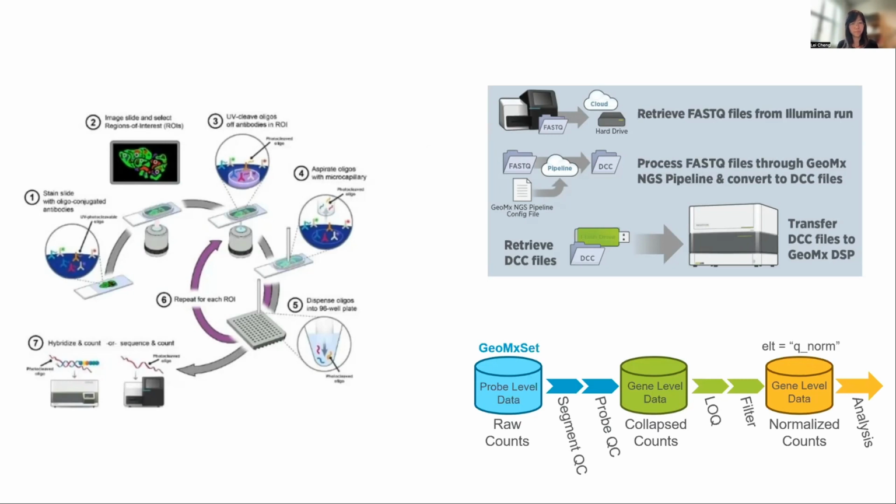And most of you probably know how these FASTQ files look. They are just basically plain segments of sequences that come out of the sequencing machine. And then the trick is to get these sequences into counts of gene expression.